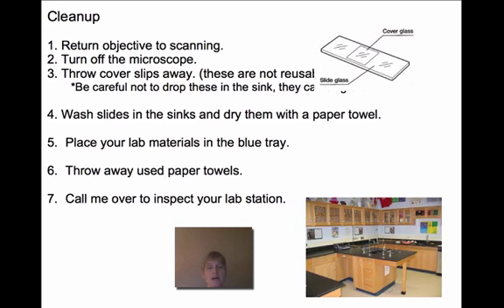All right, to clean up after the lab, you want to return the objective to scanning. So you're going to return that objective to the smallest one and turn off the microscope. That's really important because we don't want to burn the bulbs out. For your slides, you're going to throw the cover slips away. Those are not reusable, but the slides are reusable. So don't throw the slides away, just throw the little cover glass slip away.